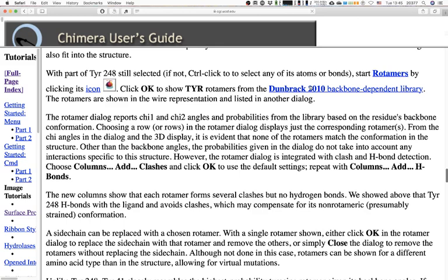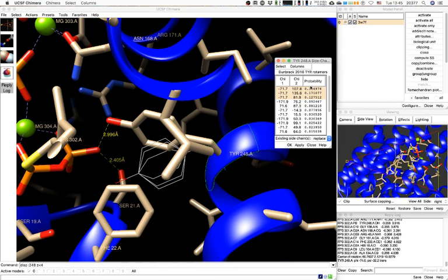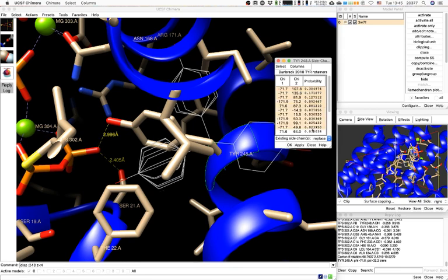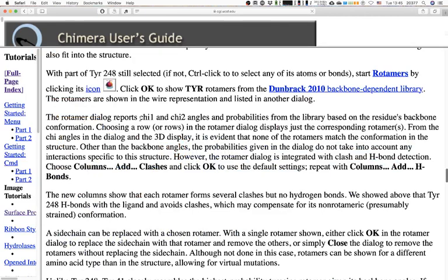From the chi angles in the dialog and the 3D display, it's evident that none of the rotamers match the conformation in the structure — I should select all of them to be sure. Other than the backbone angles, the probabilities given in the dialog do not take into account any interactions specific to this structure. However, the rotamers dialog is integrated with clash and H bond detection.